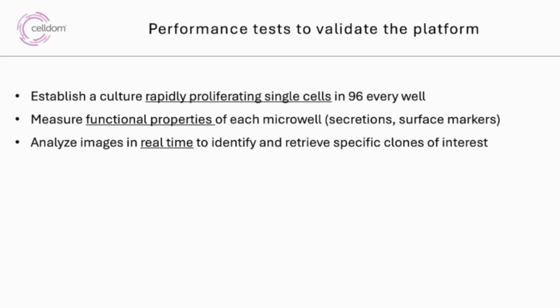Since our plates have 270,000 imageable microwells, we needed to develop high-throughput bioinformatic pipelines that use advanced computer vision tools, which can analyze the contents of each microwell, and the analysis speed had to be at least as fast as the image acquisition speed so that all of the images could be analyzed by the time of picking.